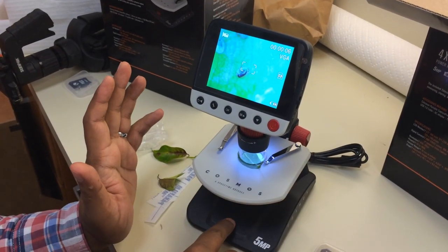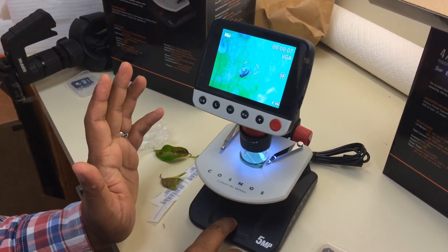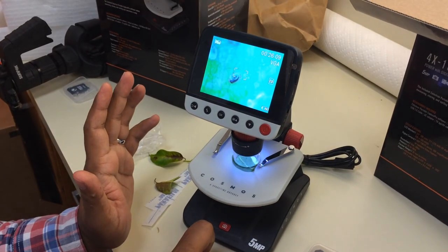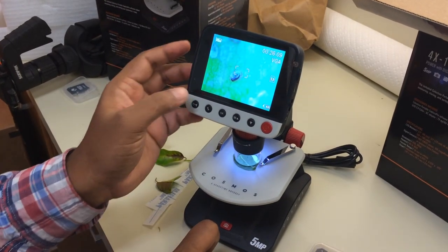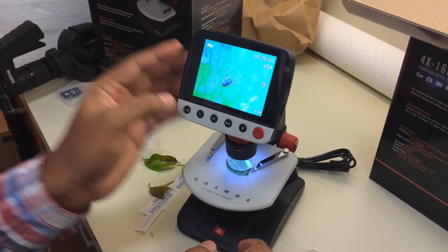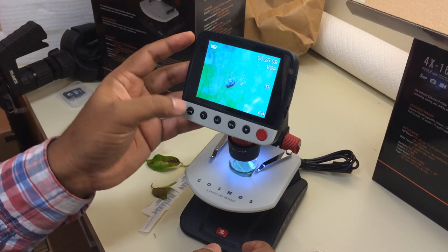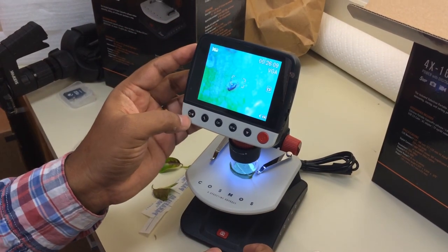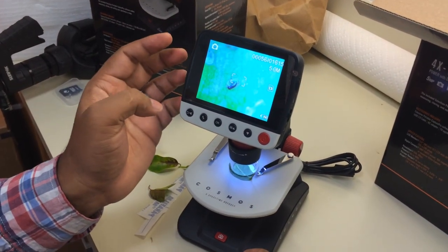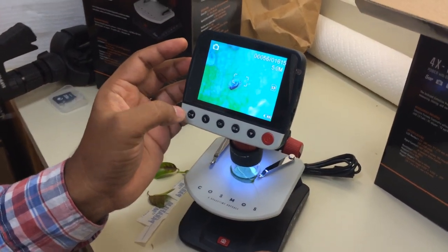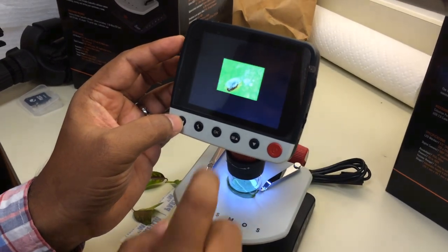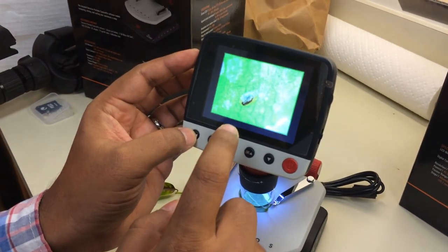Once in video mode, click here and it will start recording the video. Once you are done with your video, you can click this button again and the video will be saved.